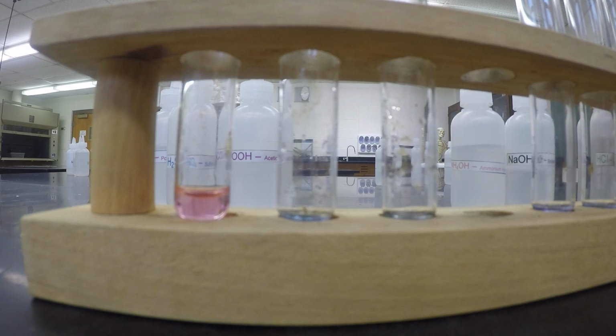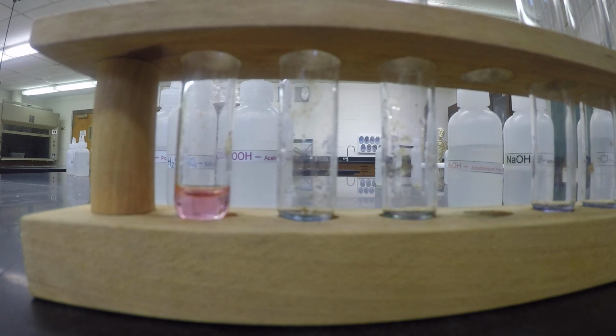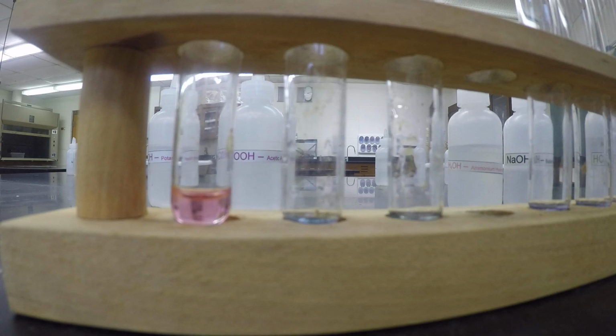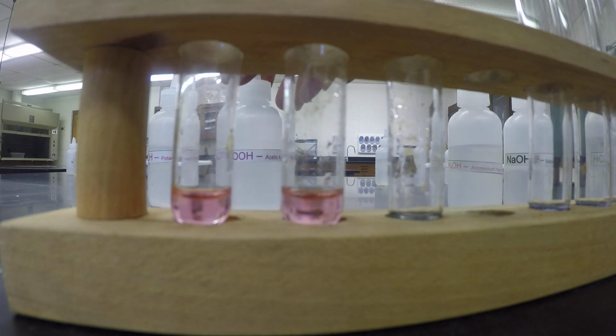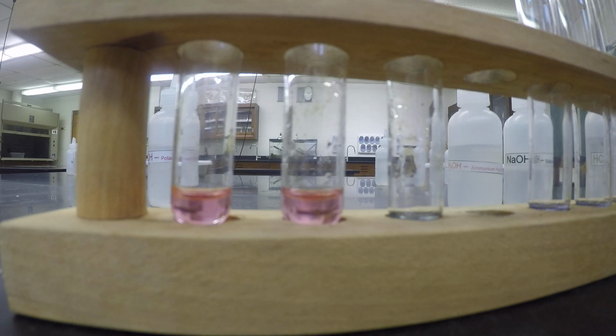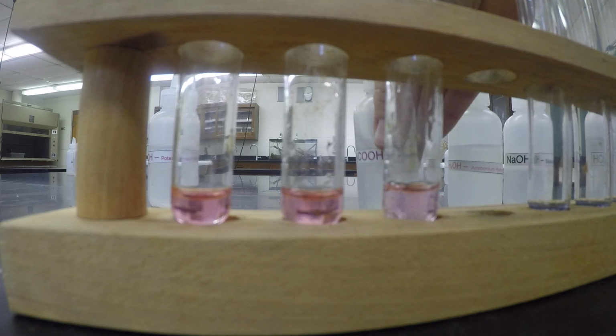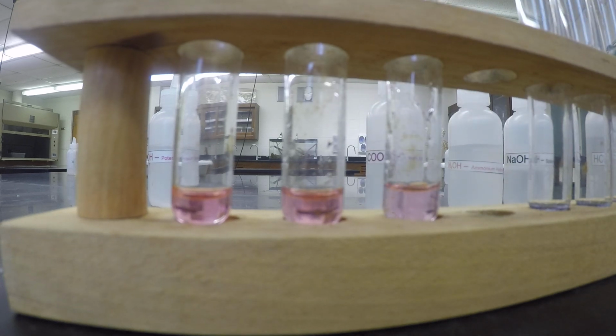Okay. Second test tube is going to have sulfuric acid in it. So these already have the cabbage extract indicator in them. Okay. And this third one, we're going to add acetic acid. So these are all my acids with the cabbage extract already in there. Okay.